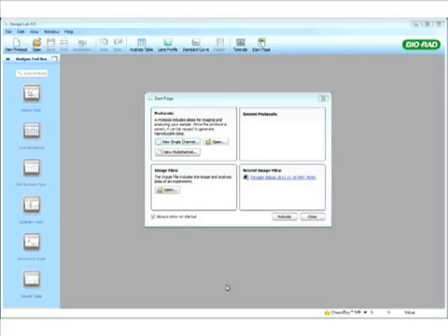The ChemiDoc-MP is a multiplexing system that can be used to detect bands on a chemiluminescent blot, on a chemifluorescent blot, and also on nucleic acid gels and colorimetric acid. So it's really a nice tool with high versatility to look at different applications.